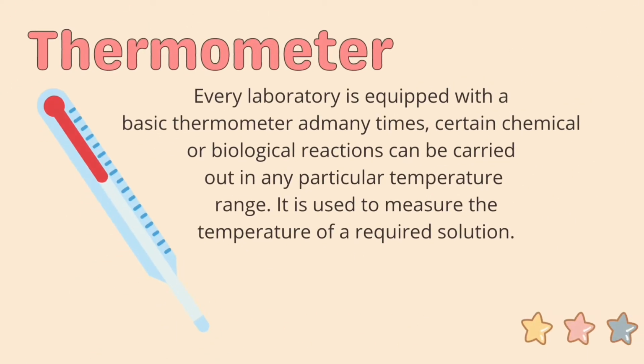Every laboratory is equipped with a basic thermometer, as many times certain chemical or biological reactions can be carried out in any particular temperature range. It is used to measure the temperature of the required solution.